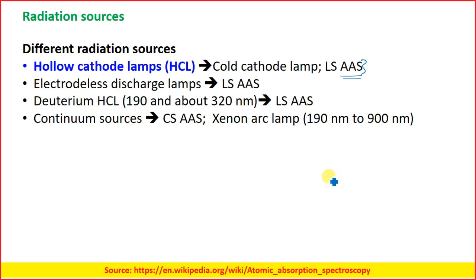If you are an environmental scientist, you may be interested in a pond. Suppose this is the pond. What is the quality of the water over here? You may be interested in understanding whether there is any mercury within this water, or whether there are sodium ions.